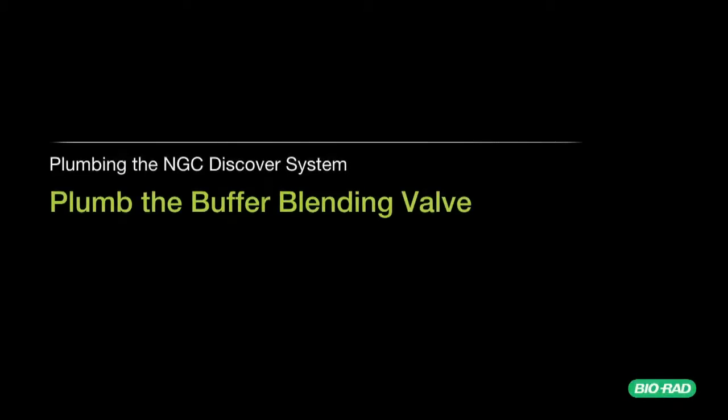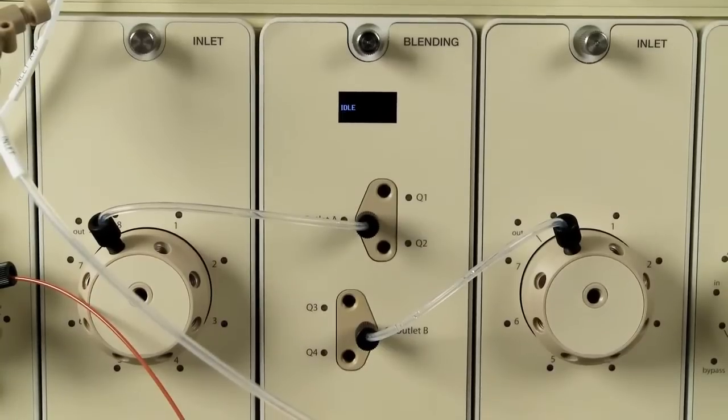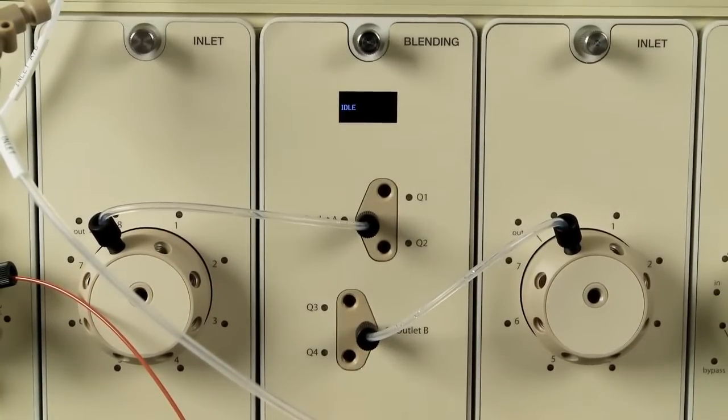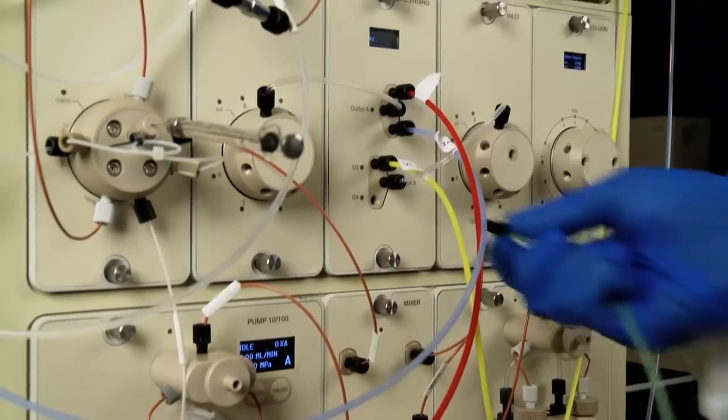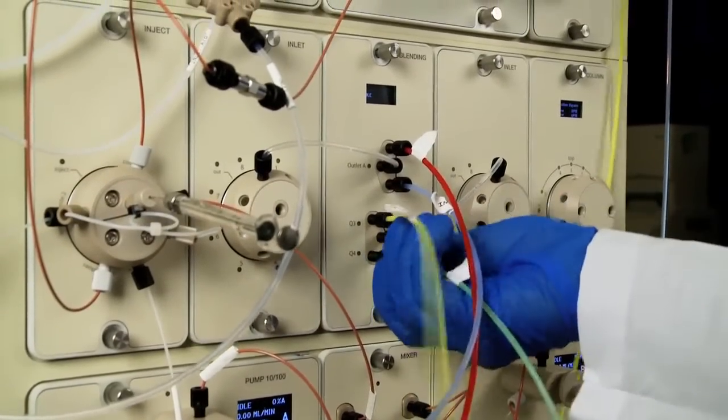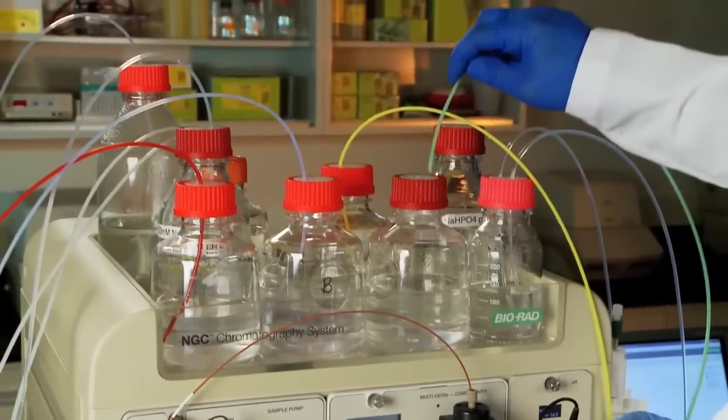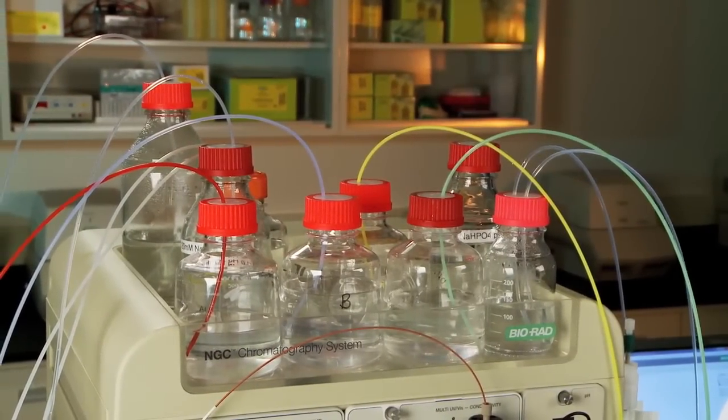Plumb the buffer blending valve. The buffer blending valve outlets will already be plumbed to the buffer inlet valves. You will make plumbing connections between the buffer inlet valves and the system pumps. Connect the inlet lines to ports Q1 through Q4 on the buffer blending valve. Place the open end of each line into the intended buffer bottle. Inlet solvent filters may be used.